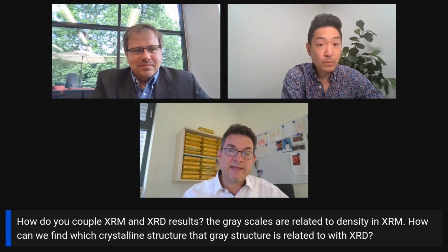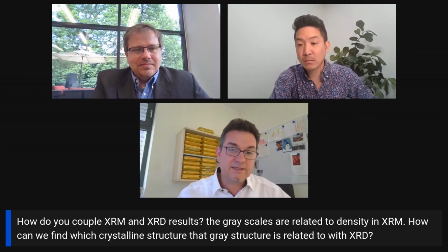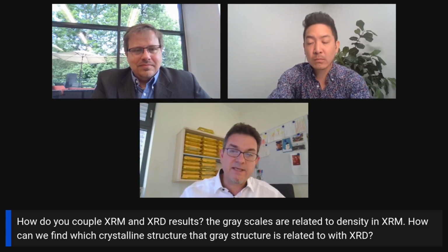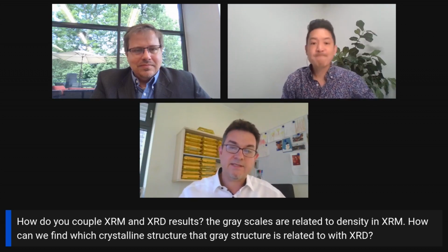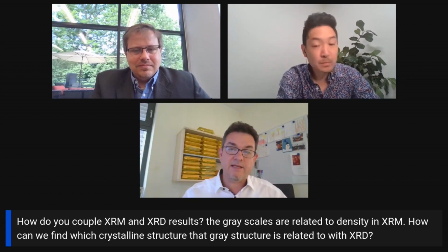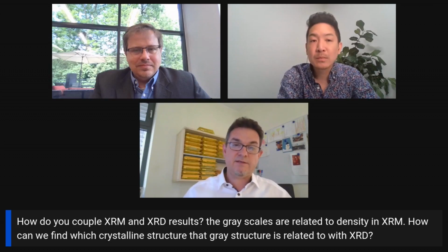But there can be tablets that consist, from an atomic standpoint, only of carbon. So there is no contrast at all, except, for example, cracks, pores, and inclusions. So it is not a magic tool, but it is certainly a very valuable and powerful addition to your lab. So a direct comparison between XRD and XRM is not as straightforward as you would think.